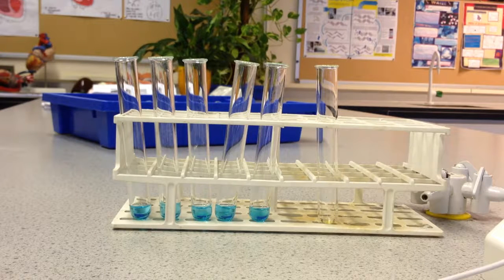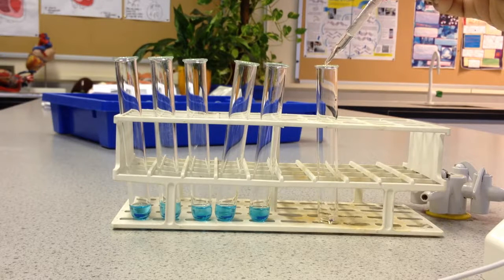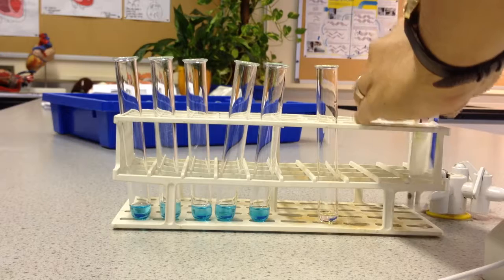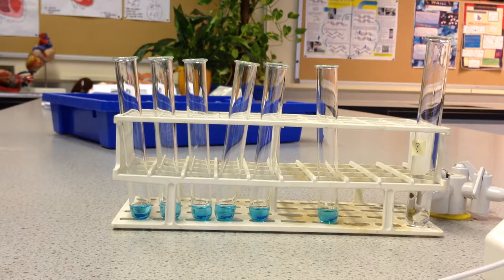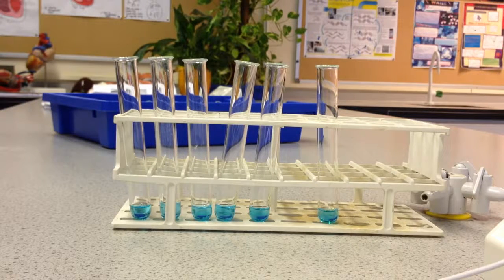So we take the same volume of unknown test solution, the same volume of Benedict's reagent, and then again to start the reaction we have to put it in the water bath, again 80 degrees Celsius for 5 minutes should do the trick.